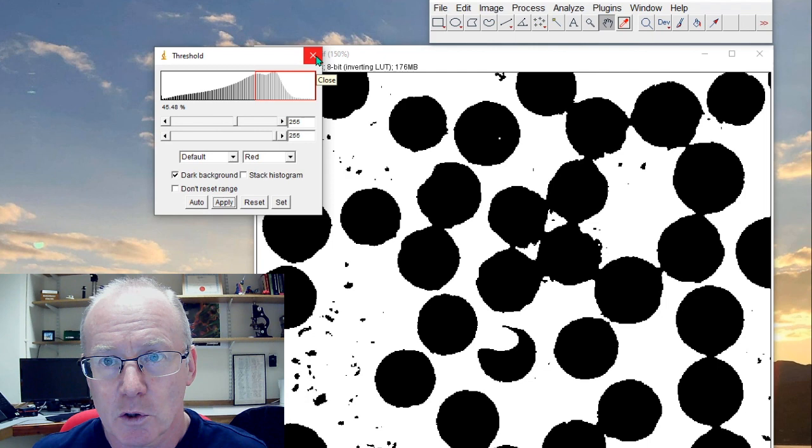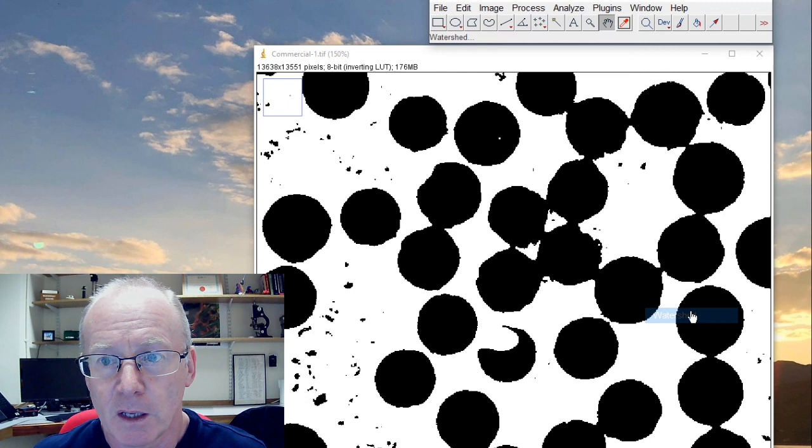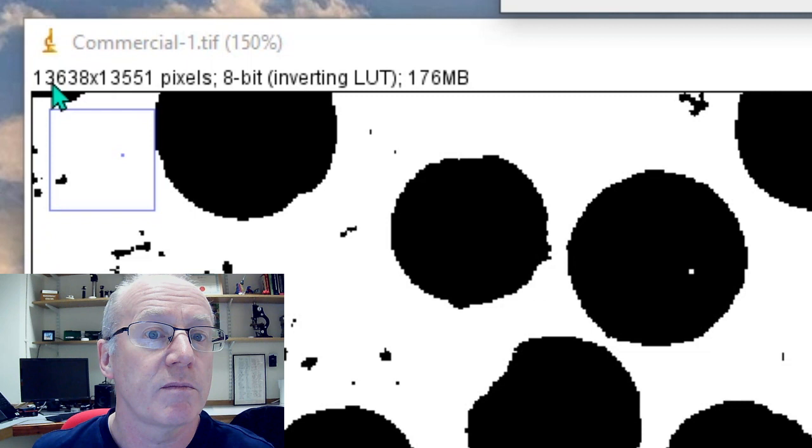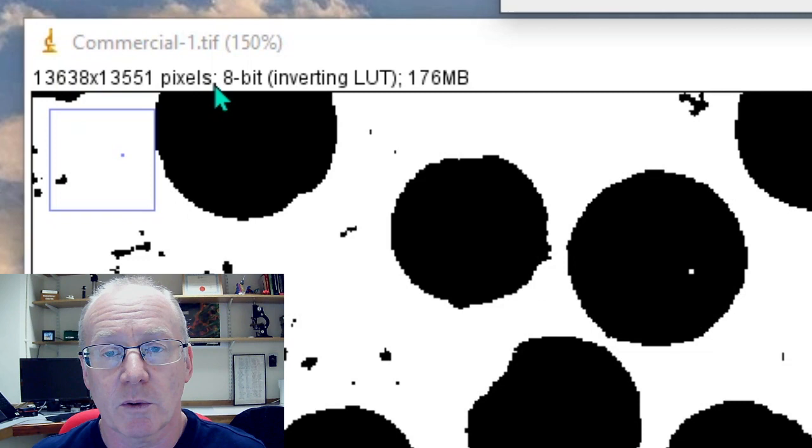So let's do the watershed. We do Binary, Watershed, and it takes a few moments to do this. This is quite a big image—as you can see it's 13,000 pixels by 13,000 pixels—so we've got really quite a large image.